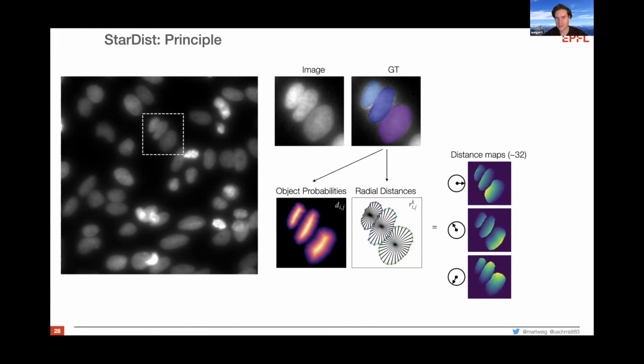So it will work. I think some colleague of yours tried it. I think Mangal tried it on Flywing, right? And it works on a membrane marker of a Flywing equally well. Yeah, of course, your label annotation must be the inside, right? That's the important thing. You need to label it as if you were labeling the inside of your cell. But if it's possible to predict this, or as a human you can do it, then there's a chance a neural network can do it as well from the raw image.